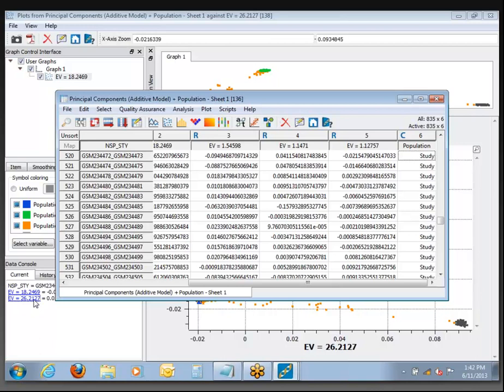Any questions about principal components and how we've calculated and displayed these? Then let's go ahead and move on to Part 6, SNP Quality Assurance. At this point we're going to back up a little bit to the original raw data and follow a slightly different workflow. For the record, we have been going for about an hour now in this tutorial.